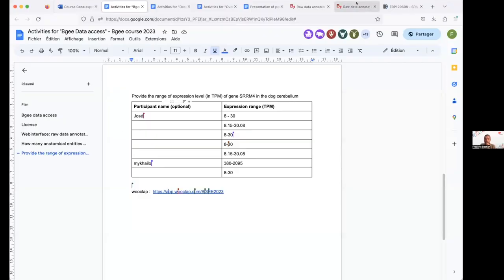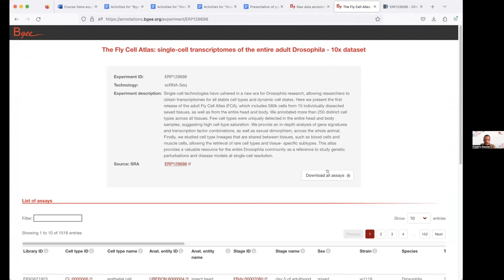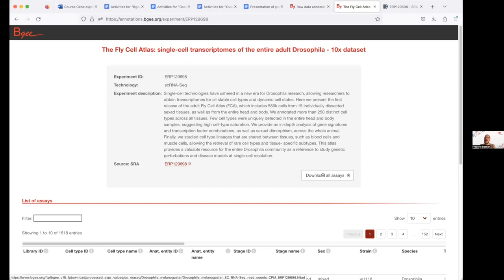I also want to show you something important: for the FlyCellAtlas on annotations.bgee.org, there is a download link providing an H5AD file. TSV is not a convenient format for hundreds of thousands of cells. The H5AD file allows you to retrieve for each cell the complete annotation — cell type, stage, sex, strain — along with CPM expression values for each gene in each cell. When you go to any experiment page on BGee, you always have a link to retrieve the processed data; for single-cell droplet-based data, it will be in H5AD format, which is in our opinion the best format for single-cell RNA-seq data.